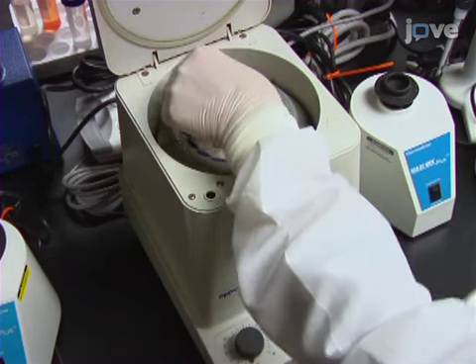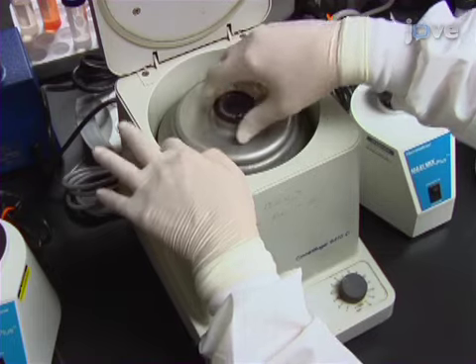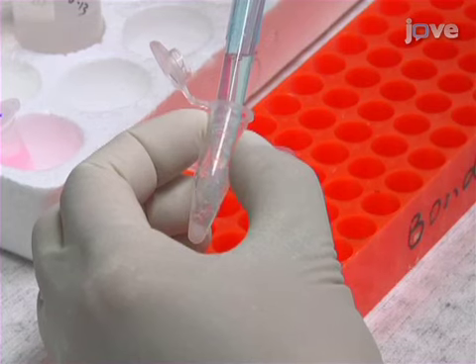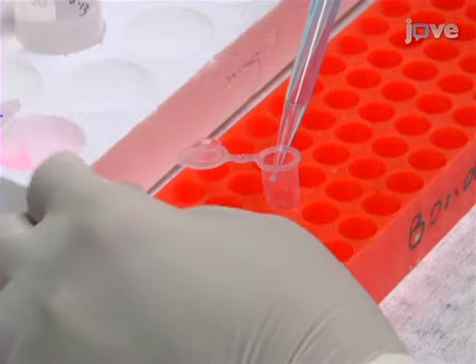Differentially microcentrifuge the suspensions at 2000 times G for 5 minutes and at 13,000 times G for 10 minutes to pellet the cell debris and DNA respectively. Collect the supernatant, hereafter referred to as the lysate.